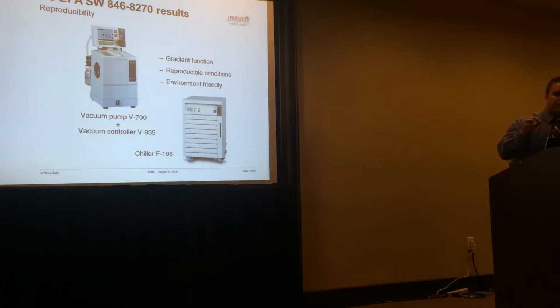vacuum settings. So let's say you're evaporating 80 mils of dichloromethane. You start at atmospheric pressure, which is roughly 1,000 millibars. Step 1, you would bring it down to 500 millibars. Step 2, you would bring it down to 200 millibars, and you do that entire process. At the end of the evaporation process, it self-aerates itself and goes back to atmospheric pressure.